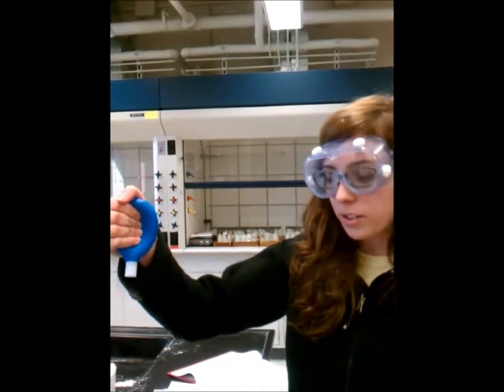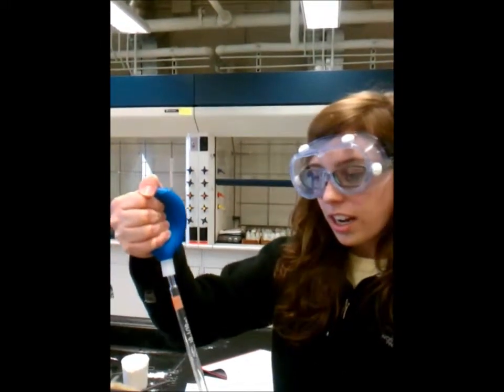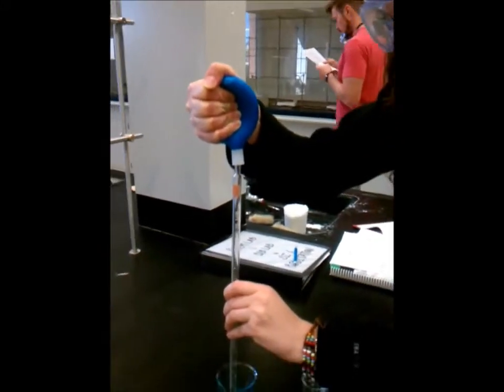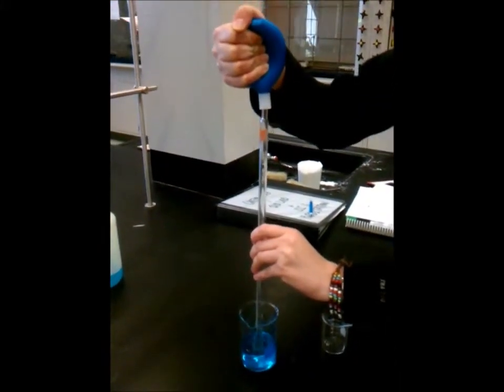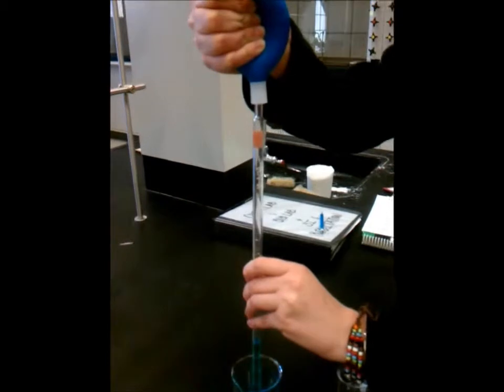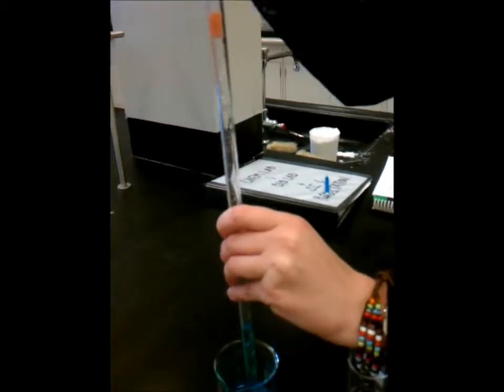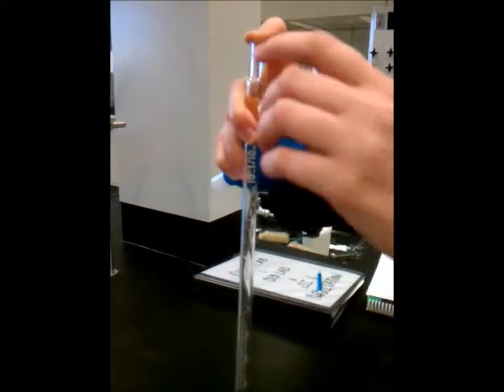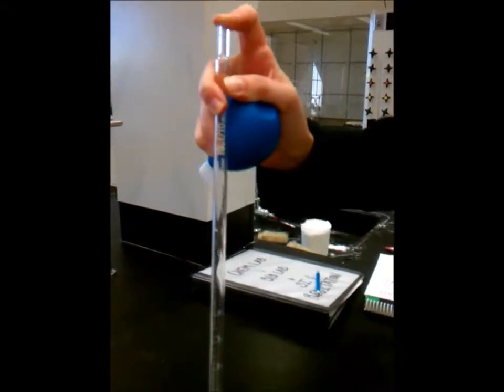My name is and I'm doing my pipette video. First thing I'm going to show is technique. My technique is to grab the bulb, we squeeze it, and we put it tightly on our pipette, put it in our solution, put it up, there. Once we're done, we replace it with our index finger. We need to use our index finger because it's a lot better grip than our thumb.